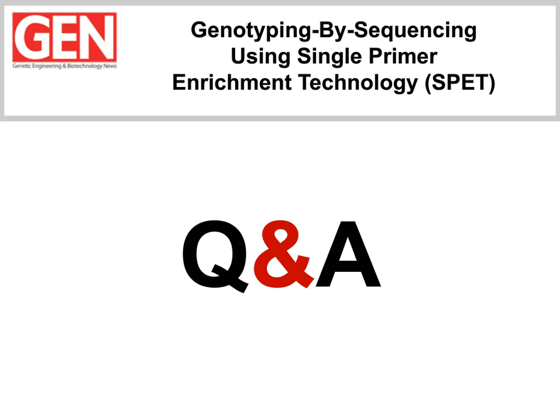Great, Luke, thank you. And can non-model organisms be used for custom target enrichment? Yes, we've used a broad range of different organisms. Of course, today you heard about the poplar.